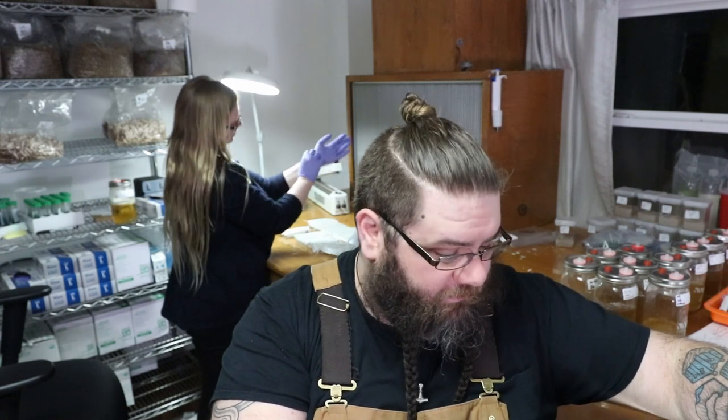But that's, and they're usually over $100. That said, for $100, this thing is able to reliably produce agar, liquid culture, grain spawn, even fruiting blocks if you're doing a small number of fruiting blocks. Typically, bulk pasteurization is still going to do you better on fruiting blocks.